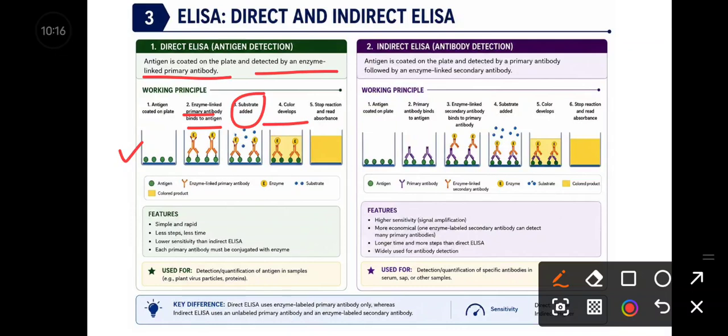Antigens are foreign molecules, mostly virus proteins, as well as fungal proteins, or any proteins from foreign pathogens, whereas antibodies are immunoglobulin proteins that specifically detect the antigen and activate the immune system. So we have to design a particular antibody for a particular type of antigen.